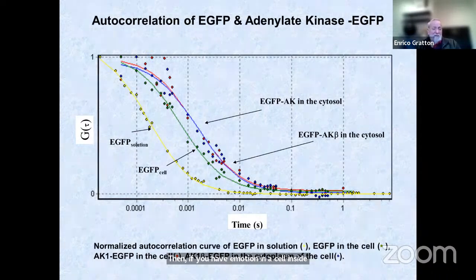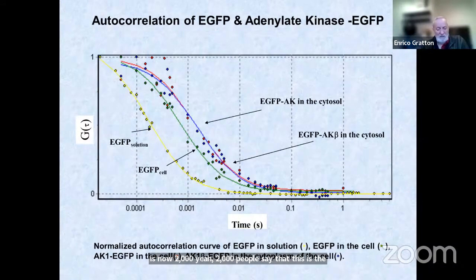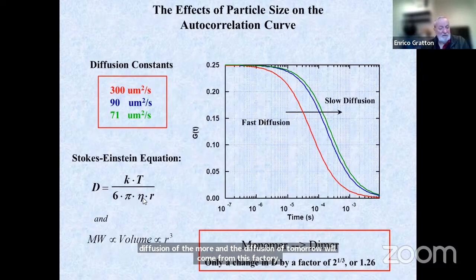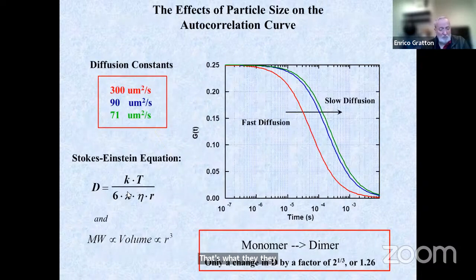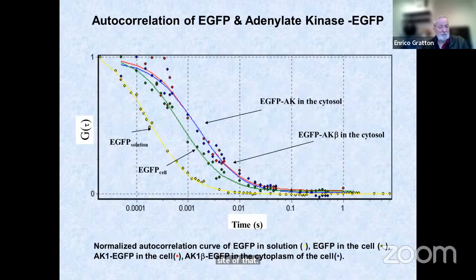Until 2000, people said that this effect is due to the diffusion of the molecule, and that the diffusion comes from a factor saying that the viscosity is different in the cytoplasm, so you will have a different time. Okay, now this cannot be true.